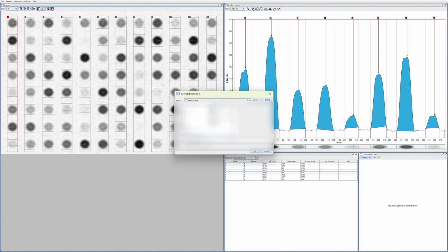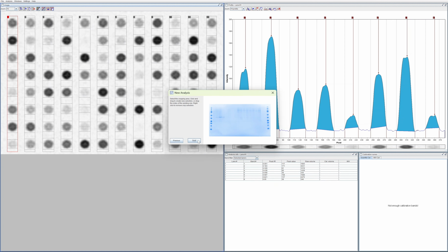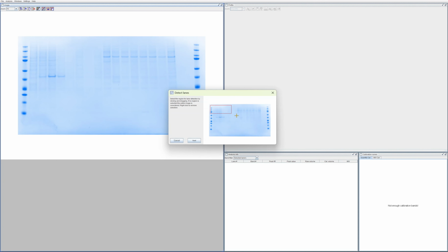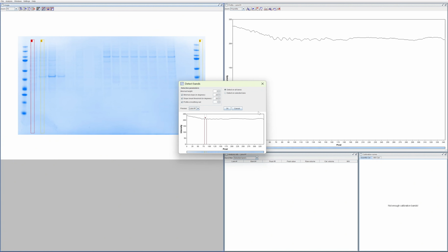An aside that's quite annoying about this file browser is you can't use the back button on your mouse to get back. You have to use this up one level button. I think that's probably because of the age of the module that's in it. So I have to go through all the rigmarole of doing this, even if I just want to get through to the image. Come on.